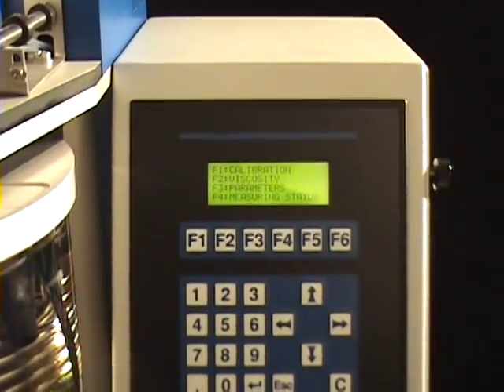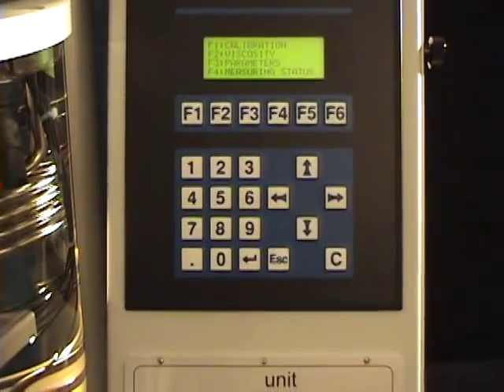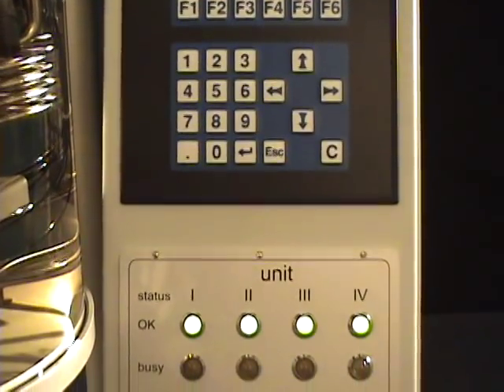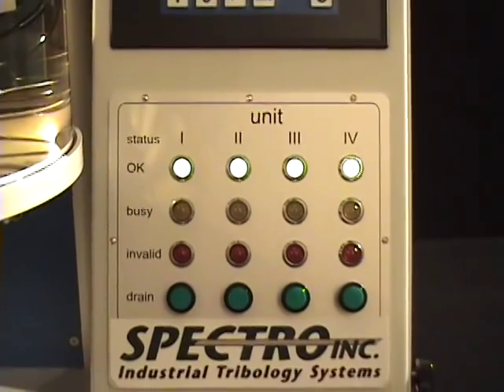The central control panel, located on the right, consists of a clear LCD screen which provides continual information to the user, and below it, a matrix of brightly colored LEDs which give visual feedback about the system status.